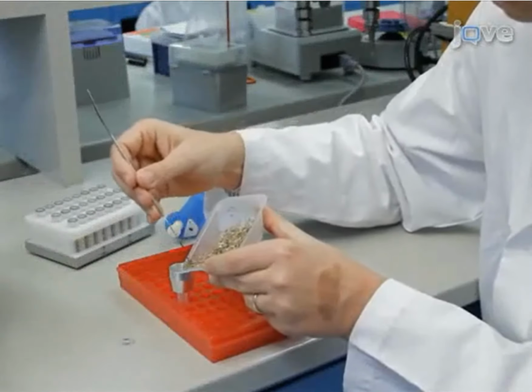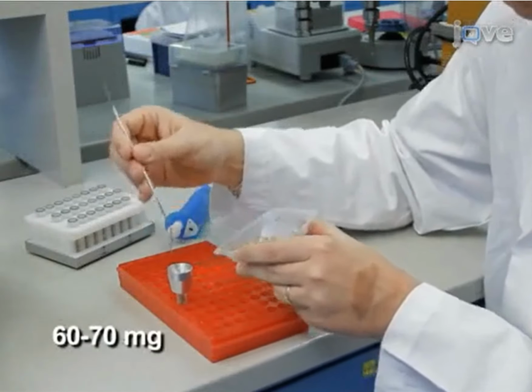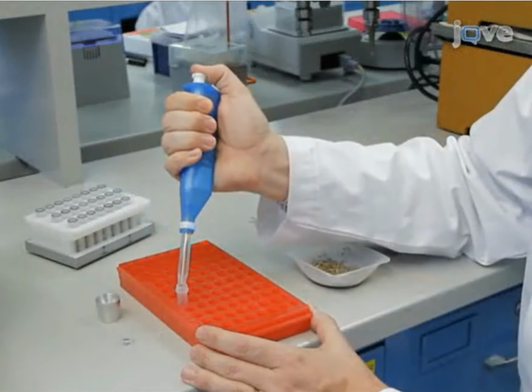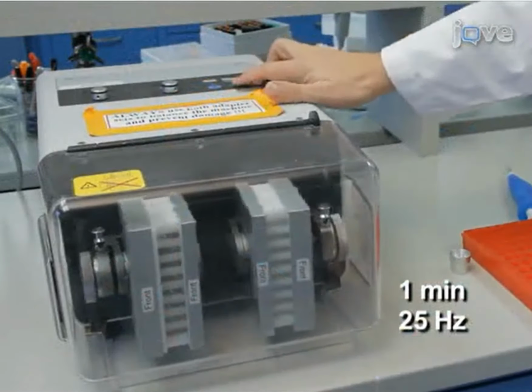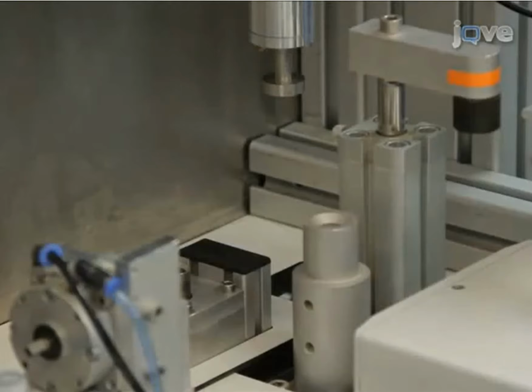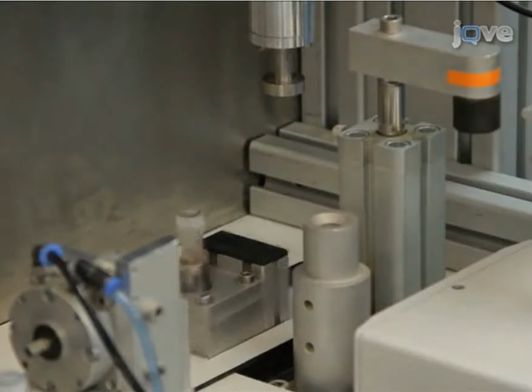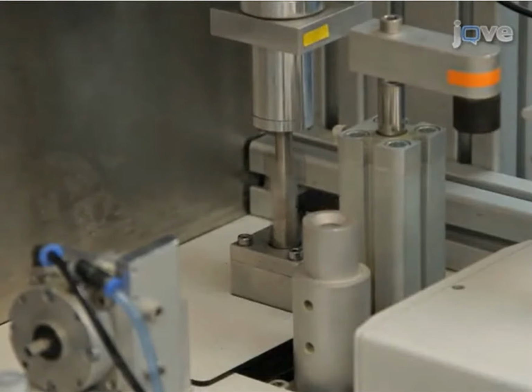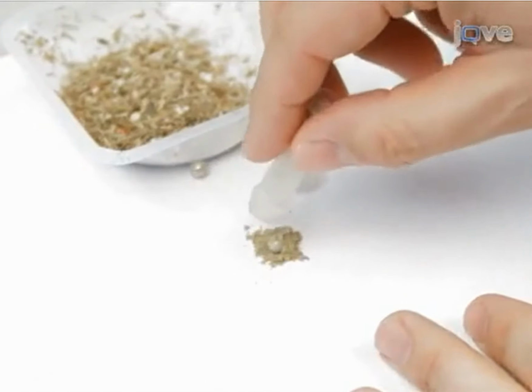Begin this procedure by isolating cell walls. Grind roughly 60 to 70 milligrams of dried plant material with 5.5 millimeter stainless steel balls in a 2 ml Sarstedt screw cap tube using a Retsch mill. As a high-throughput alternative, use a grinding and dispensing robot termed iWall as described in Part 1. When grinding is complete, remove the steel balls.